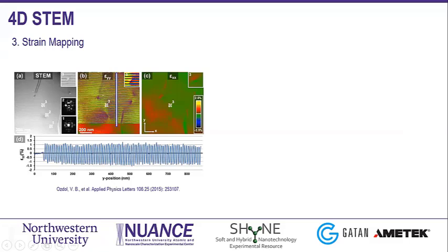For example, regions like this, if you can see my mouse here, are a little bit off axis, but as long as you can see the diffractions you're interested in, to analyze the variation in reciprocal space, it's still possible to reconstruct the strain, plot the strain tensors and plot the strain maps here.